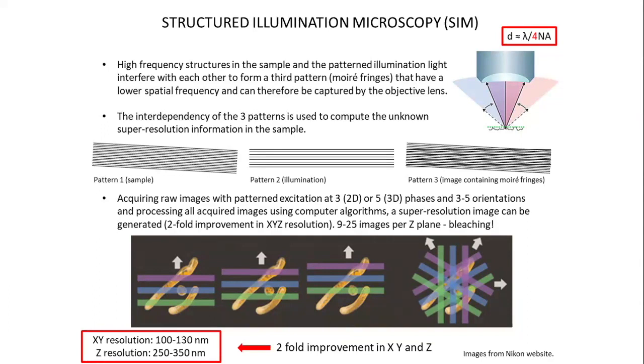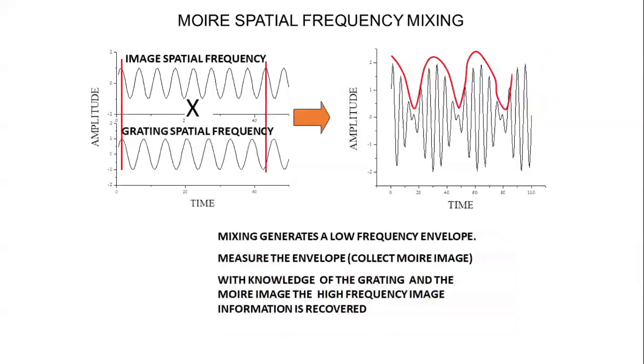And just to recap that, we've got some known spatial frequency down here on the bottom one. We multiply it effectively by illuminating the object with that lower one. Those two signals beat, and that red curve is generated. So that red bit is the bit that gets through the microscope. We can basically contrive to get that red stuff all the way to the edge of the regular transmission curve, the OTF, and double the resolution of the microscope. So high frequency information is recovered.